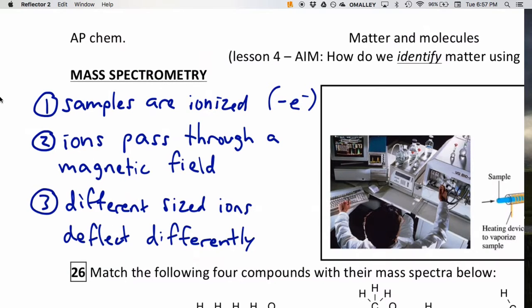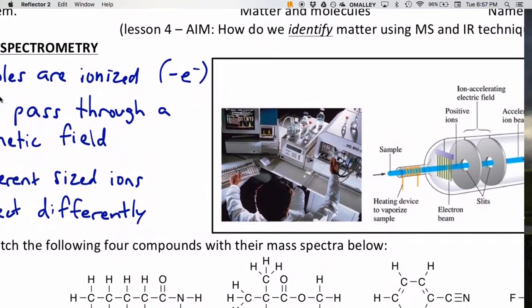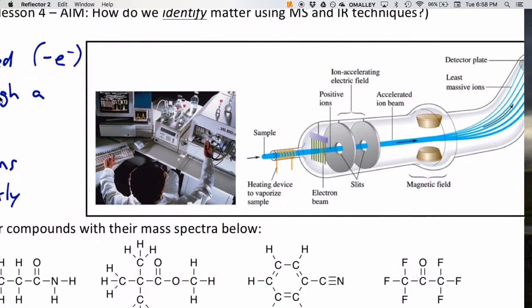So off to the right I have a schematic of what that all means. Here we have a picture of a typical mass spectrometer. It can sit on most desktops and is attached to its own type of computer. A chemist will inject an amount of their sample into the mass spectrometer, and a special electron beam ionizes it.